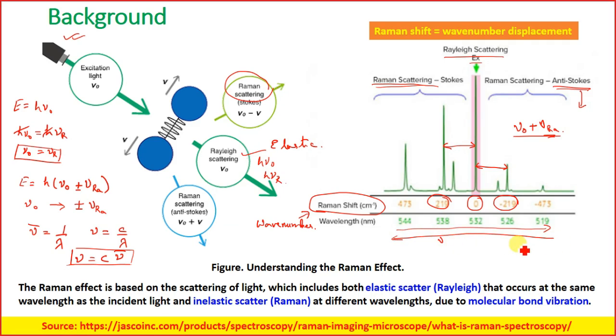So the frequency will be highest at this position and lowest at this position.